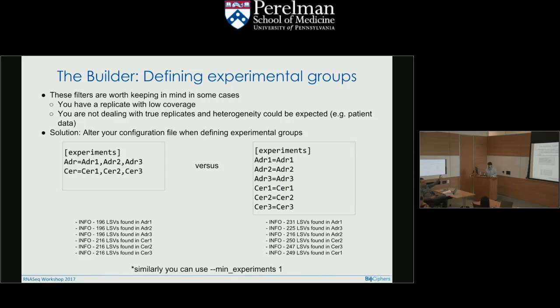Okay, so notice the original definition of the 51% in a group. The reason for this is, we tend to develop this to our own needs, right? We did this because when we did this initial analysis, we wanted to be very conservative when we did this genome-wide view for the eLife paper about what we report.